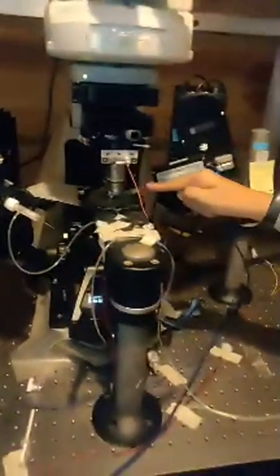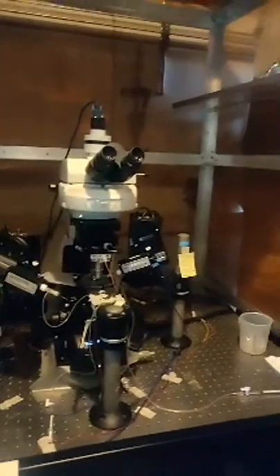One of the electrodes is going there, in which there is a solution, and when we go and touch the neuron, we can actually record the activities there. So basically, these instruments connect with the fish's neurons and record what's happening inside. Exactly, because neurons talk to each other through these electrical signals.